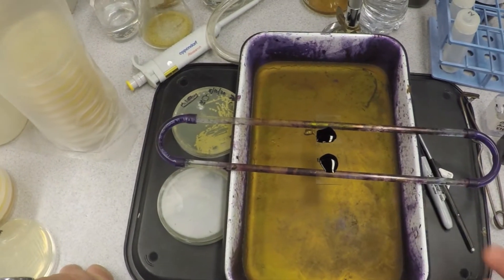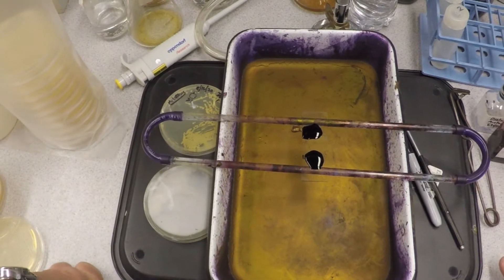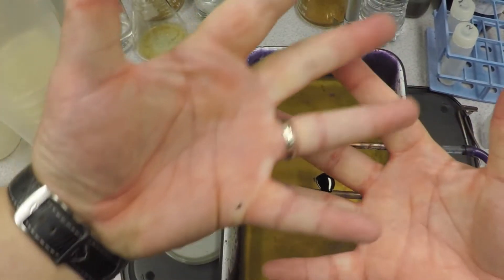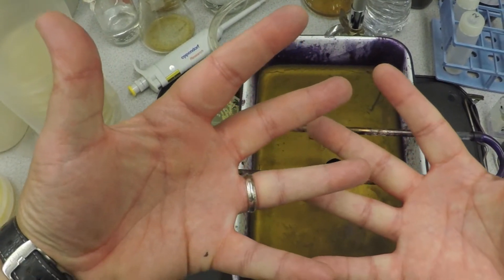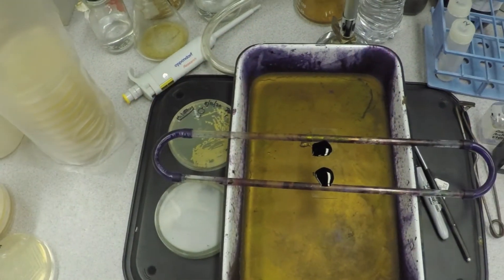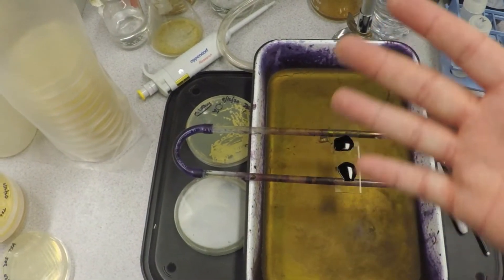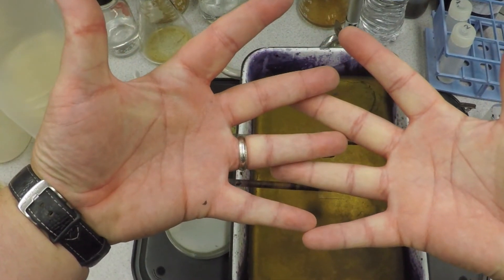The point of the gram stain is this: gram-negative cells have a thin cell wall — it's very pliable and has lots of space between the peptidoglycan layers. Gram-positive cells are much tighter. Once we add a little alcohol, the crystal violet should be washed out freely from the gram-negative cells because it passes through those openings.